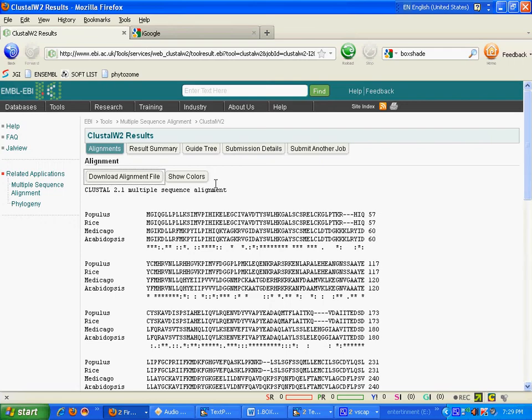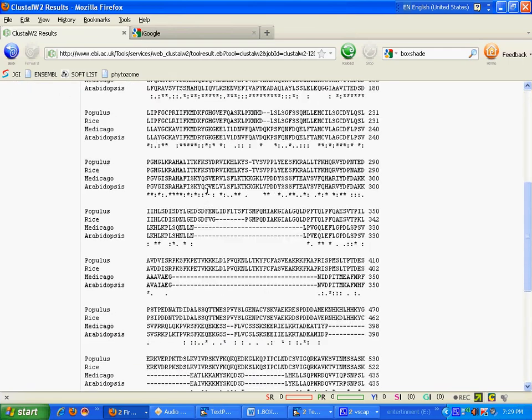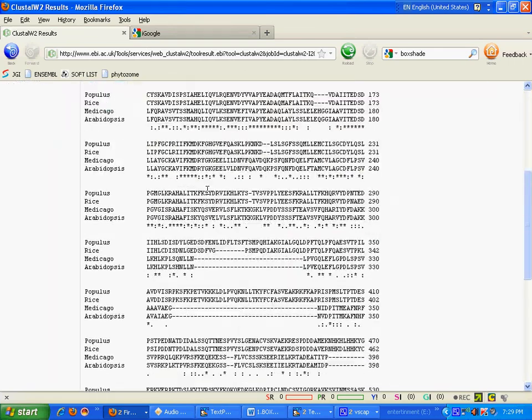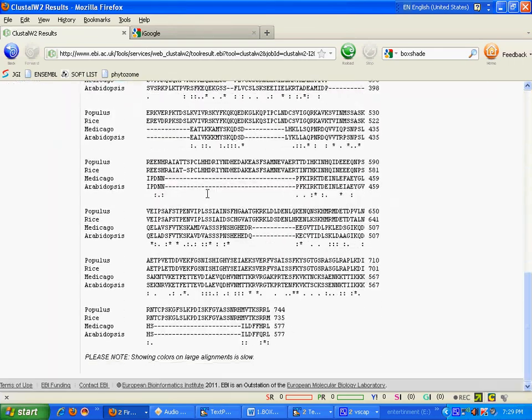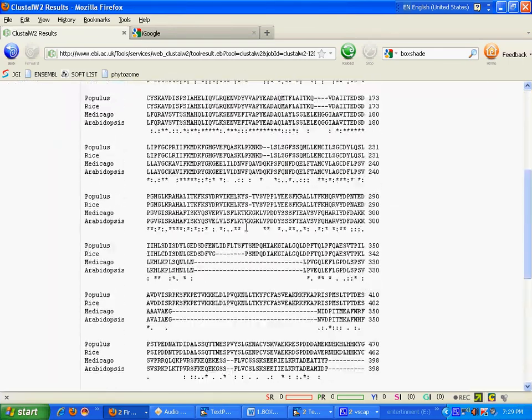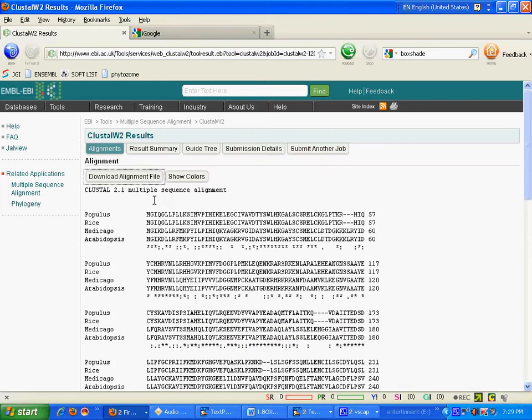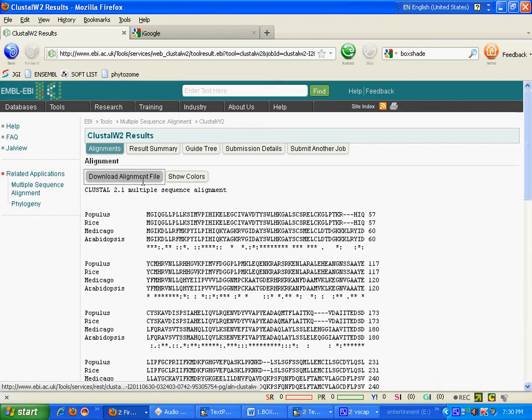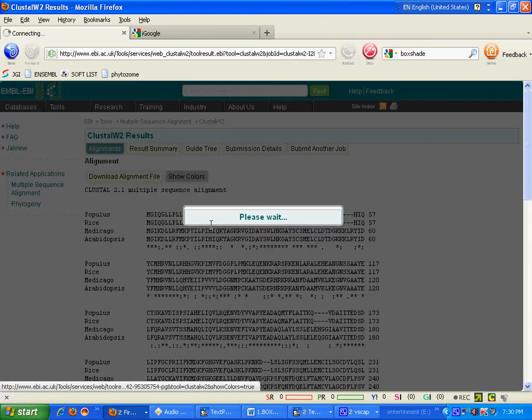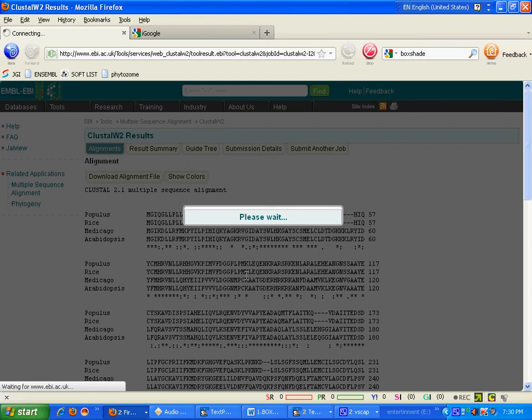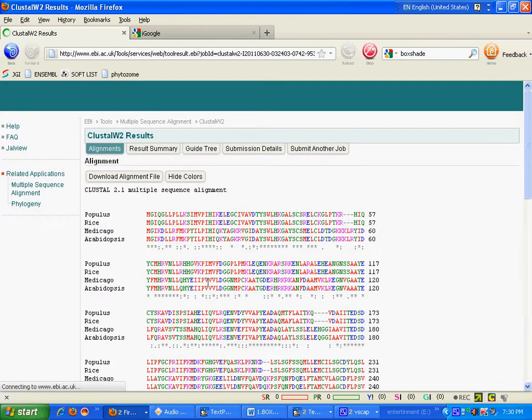Now your result is ready. Here, everything. You can download your alignment file by clicking on download alignment file. And you can show your multiple sequence alignment in different colors. Like this.